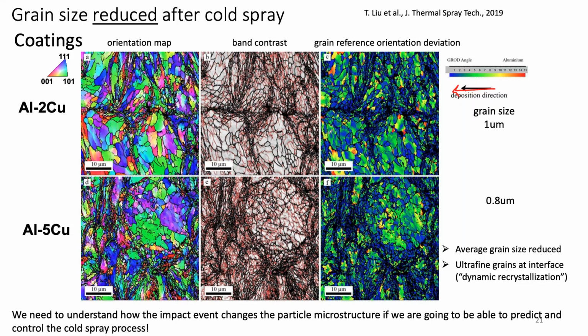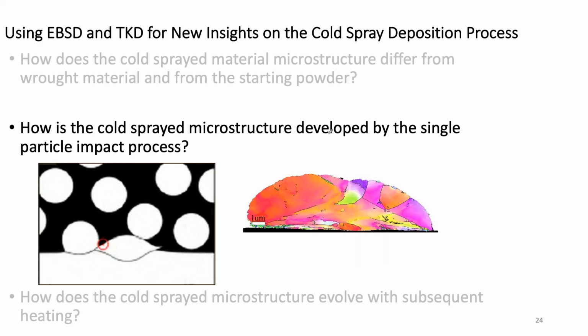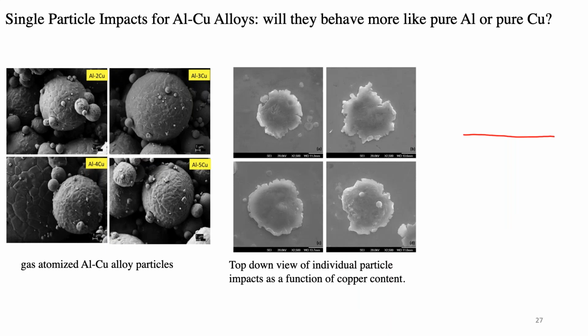In terms of the single particle work, that's all focused ion beam developed, because I'm not quite sure how you would do the single particle work without a focused ion beam, given the site-specific nature of it. It's not clearly labeled here, but I think this is about a 5 micron scale bar. As you're trying to cut across this particle, you're probably going to need a focused ion beam. You could try it in cross section, but it'd be rolling the dice. You'd have a lot of dud samples if you tried to do that mechanically.